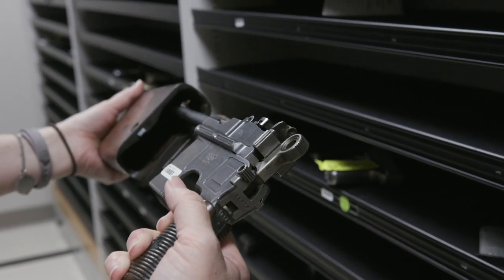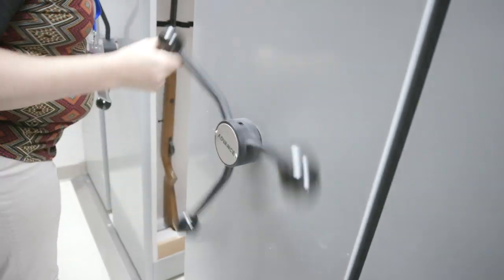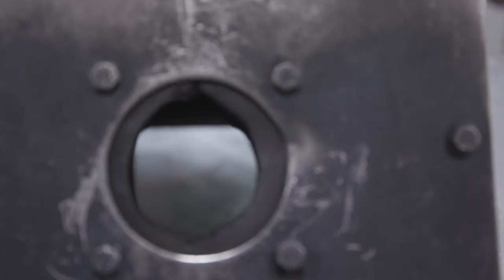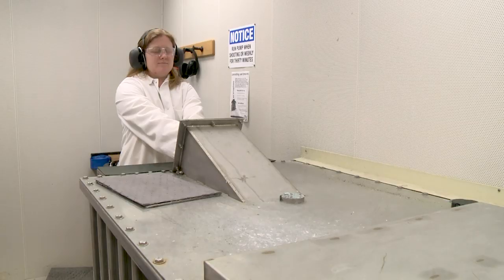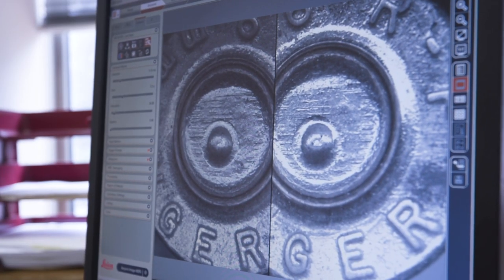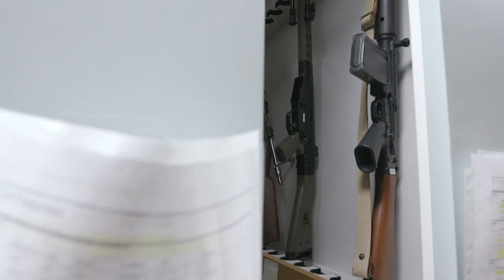The firearms investigation lab maintains over 900 gun models on site which can be used to compare against those suspected in crimes, utilizing ballistic tank measurements and microscopic analysis to reveal the make and model of firearms used whether recovered or not.